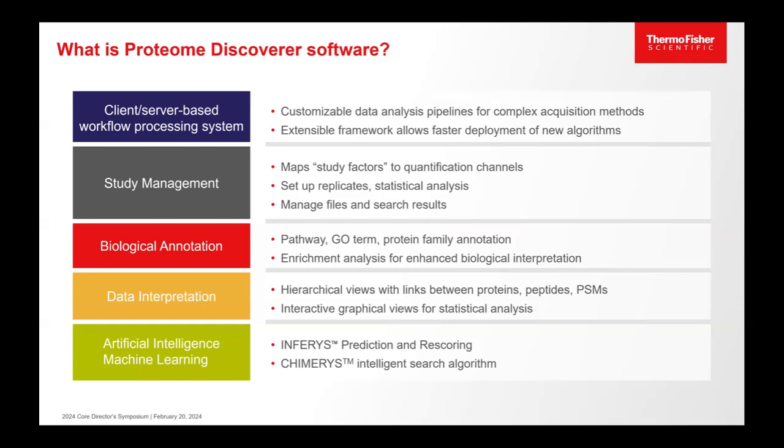We have MS2, we have MS3 acquisition methods. And we need our proteomic software to be able to analyze all of those. So from the very beginning, the architecture underneath Proteome Discoverer is this client-server-based workflow processing system, which has a collection of nodes that you can draw on a workspace that allows you to do filtering by MS level, fragmentation level, fragmentation type, but also allows us to deploy new algorithms into the software more quickly.